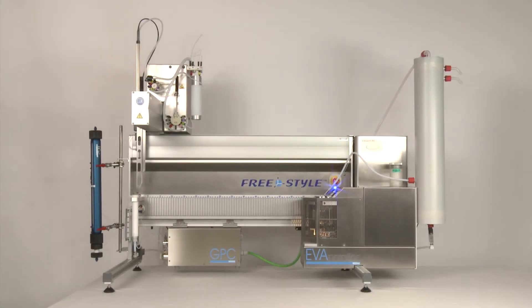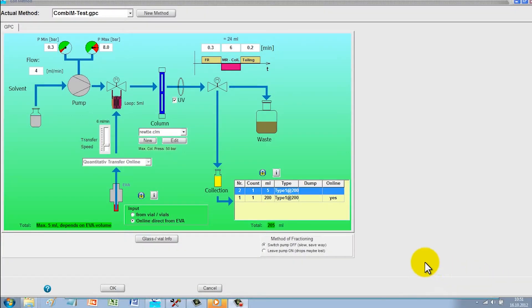This process, which we have just seen in the hardware, is precisely mapped one-to-one in the software. The method screen shows the sequence of a GPC process.